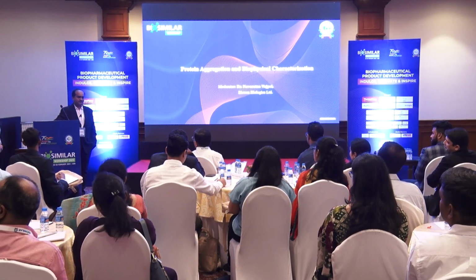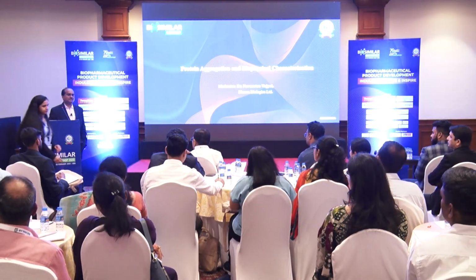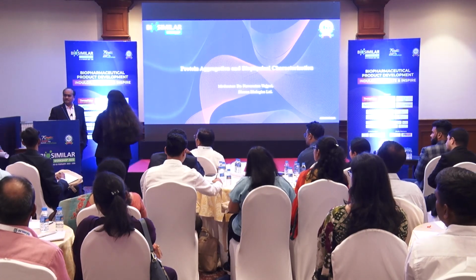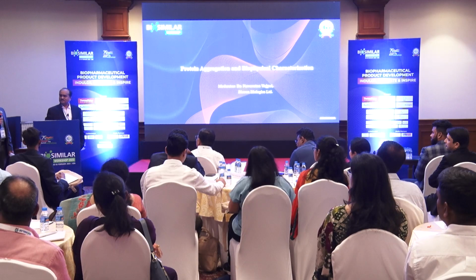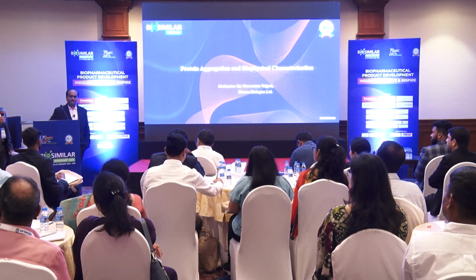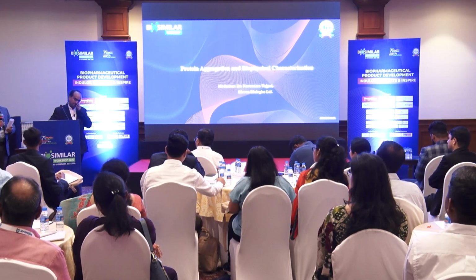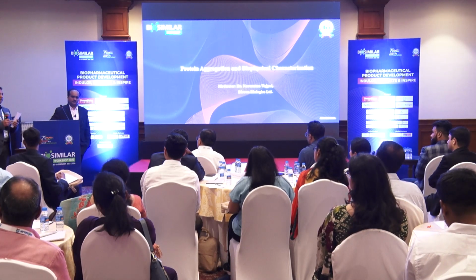So I think that's what we can reflect from these data: small changes that we are monitoring using biophysical techniques. Certainly. Yes, Rajendra. So just to add on to what he said, if the structural perturbation is on a site which can lead to an immune response, that is something to be characterized, and that can be done by a combination of structural biology and functional assays, which this technique alone cannot provide.